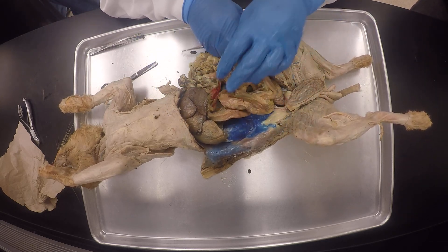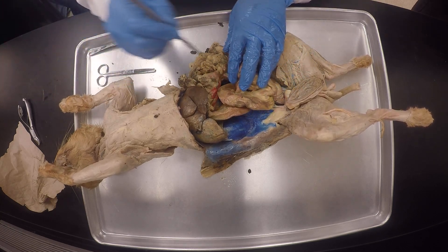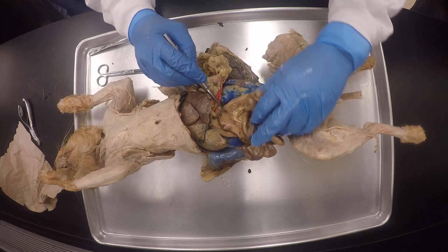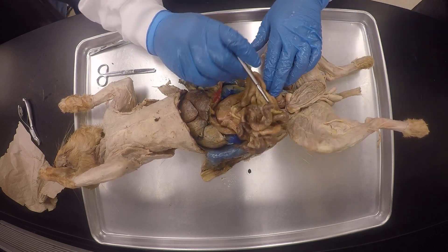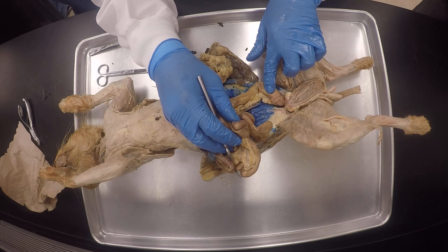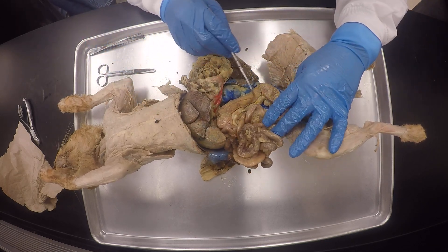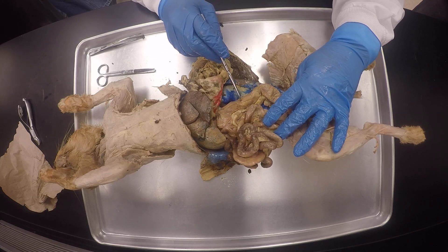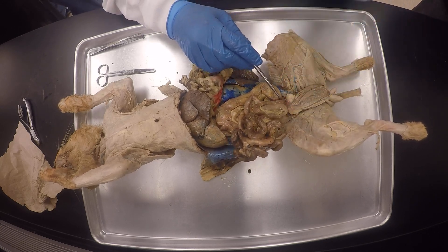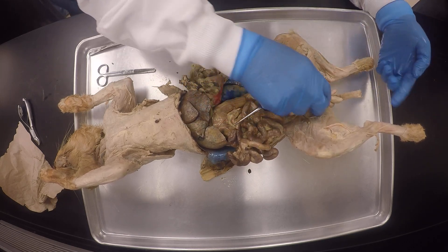This is the ascending colon, and then it forms an inverted U shape. So this is the ascending colon, this is the transverse colon, and then this is the descending colon. This cat had just eaten and was about to go number two — so the descending colon is full. There is no sigmoid colon in the cat, and then it goes to the rectum, and then out the anal canal.